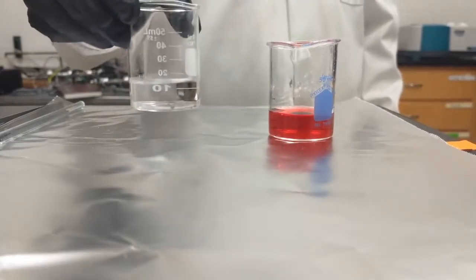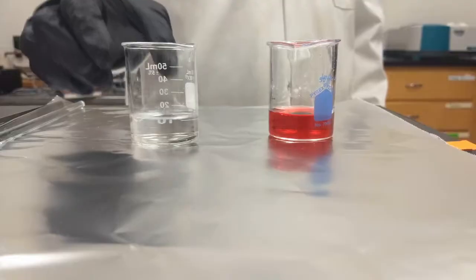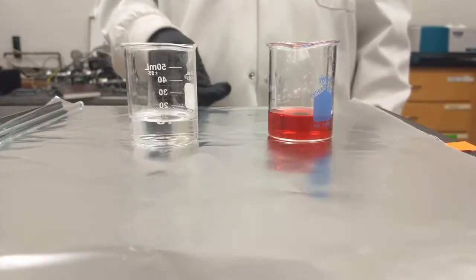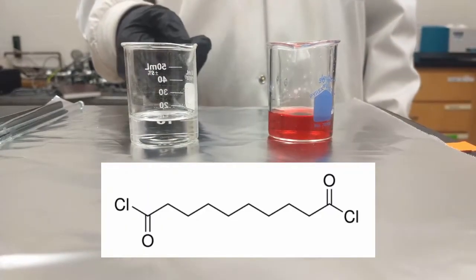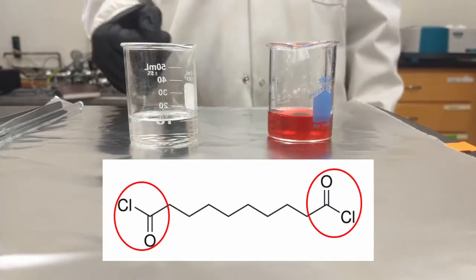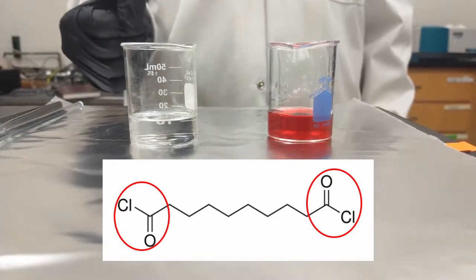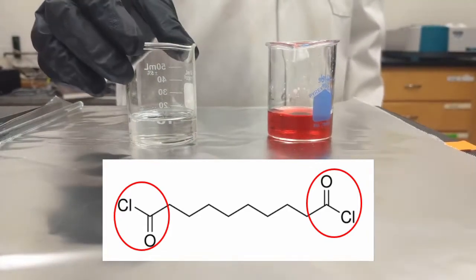In our other beaker, we have the hexanes and this contains the acid chloride. This means that this monomer has an acid chloride functional group on either end. This is made up of carbon, oxygen, and chlorine.